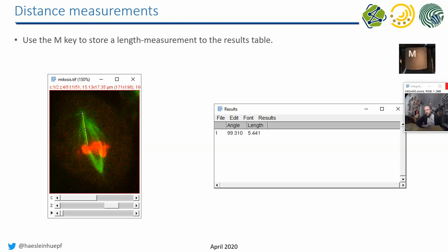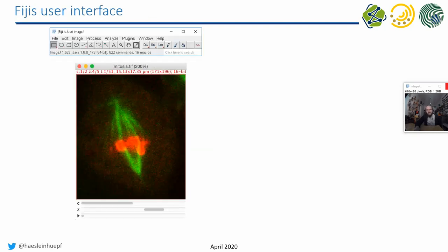You can press the M key on your keyboard to save a measurement into a results table, and it works in many contexts. For example, when you draw a line you get a length measurement; if you draw a circle you can get a mean intensity measurement. That sometimes really helps to get rough measurements quickly.